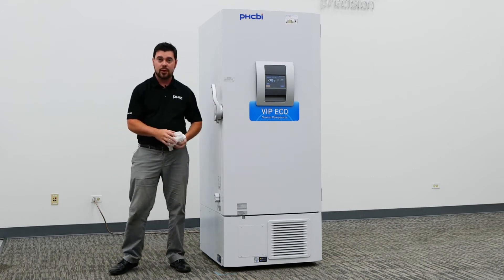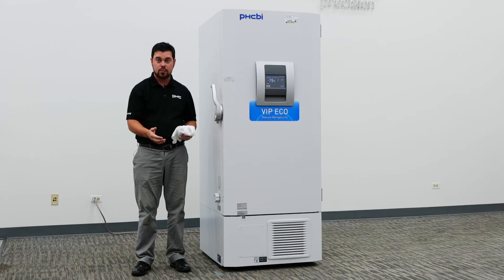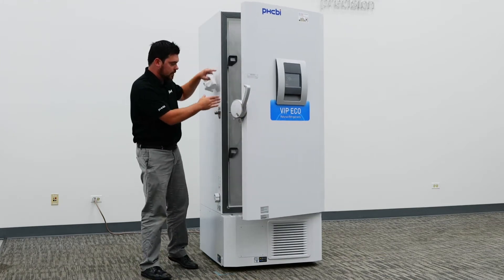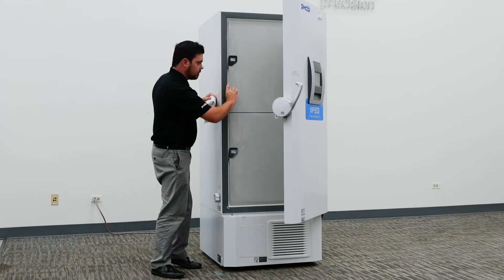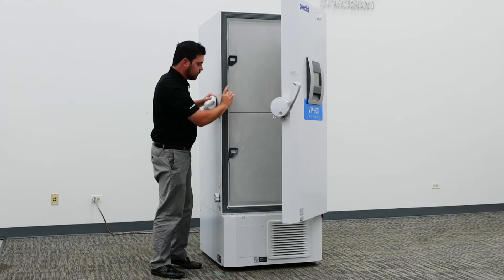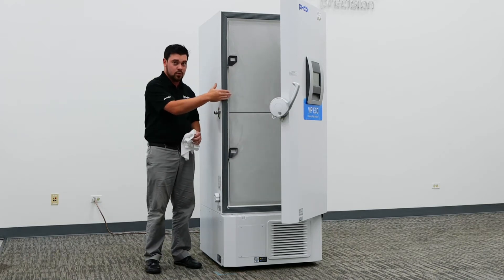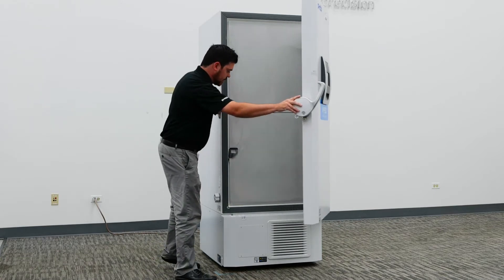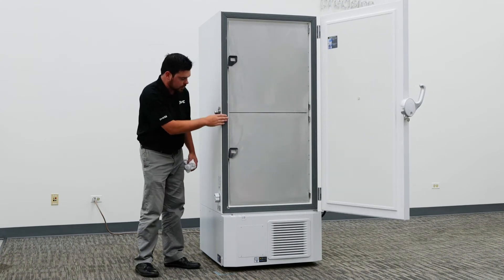One quick test to verify that the gasket is working properly is visually inspecting the inner doors to ensure there is no excessive ice buildup in familiar or certain patterns. For instance, if we had a slice or debris inside this portion, the gasket will see a lot of ice buildup in that formation — because of the equalization of ambient air flowing through, then condensing and freezing in that general area.